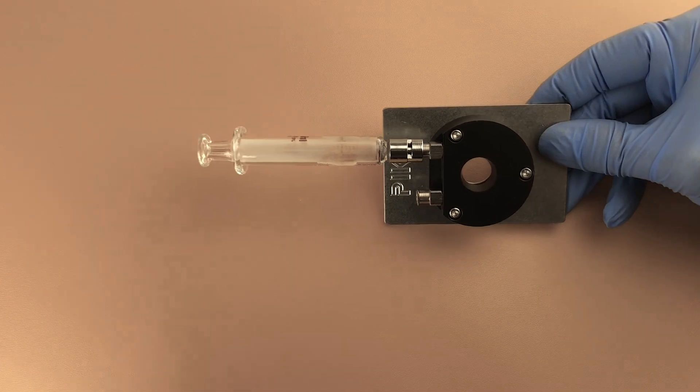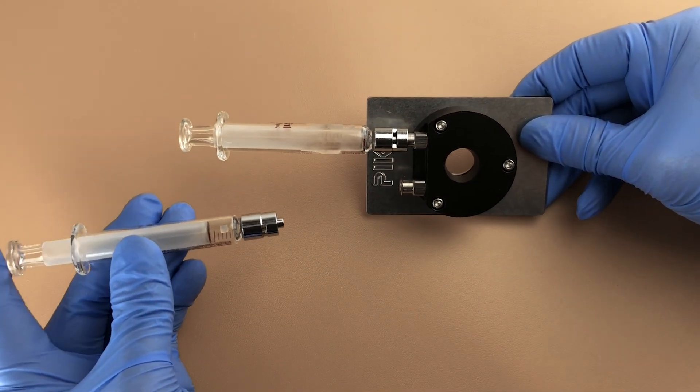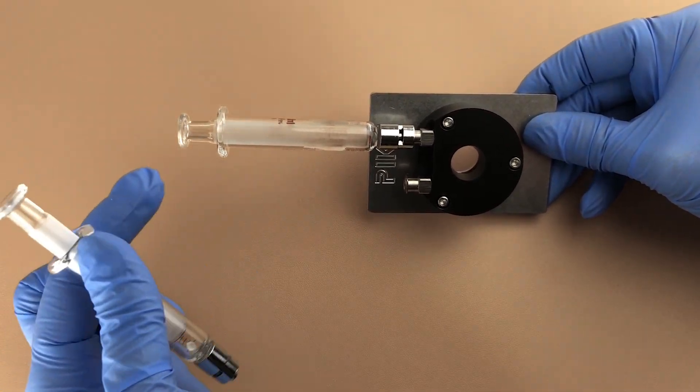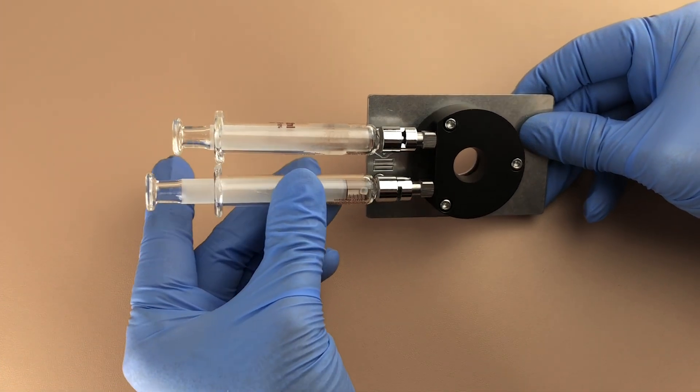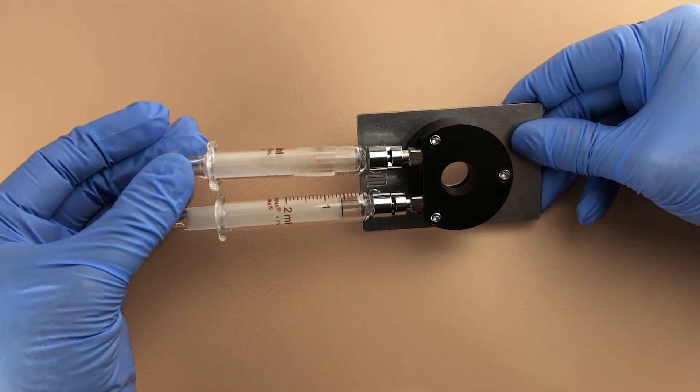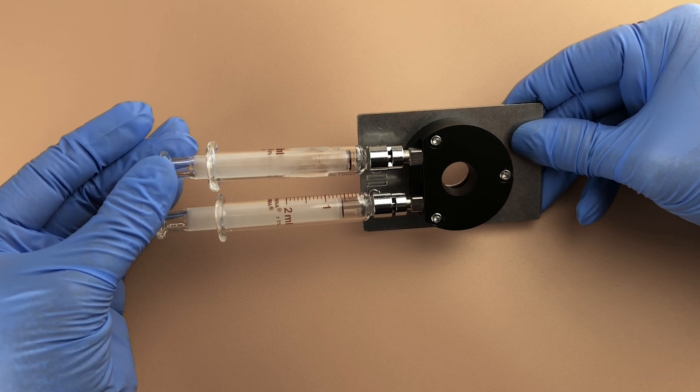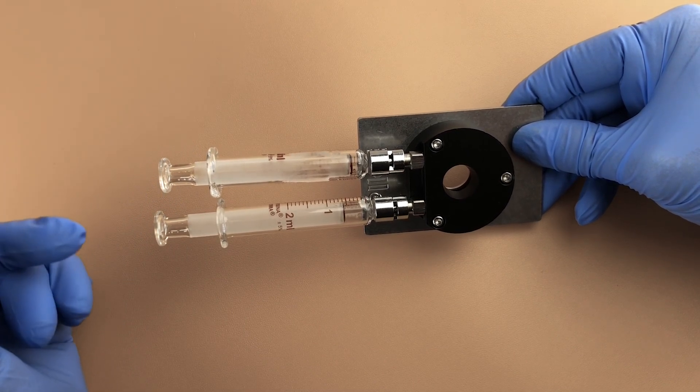When I'm filling a liquid transmission cell, I'll use two 2 milliliter syringes. One will be empty and the other will contain the sample. To fill the cell, simply pull on the empty syringe and this will create a pressure differential that will pull your sample through the cell.